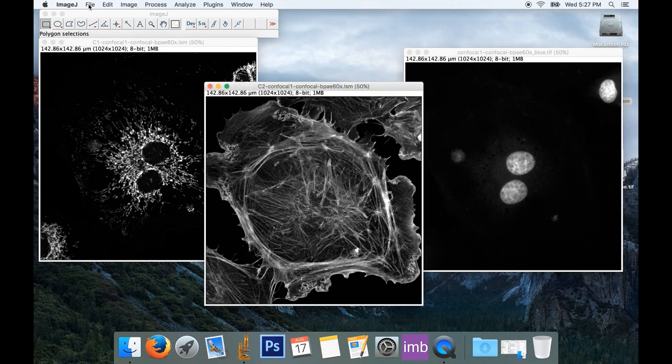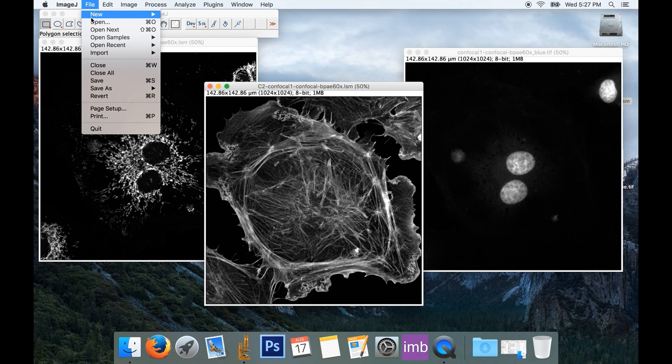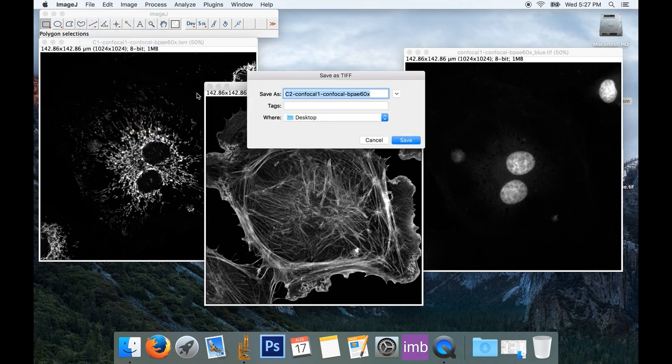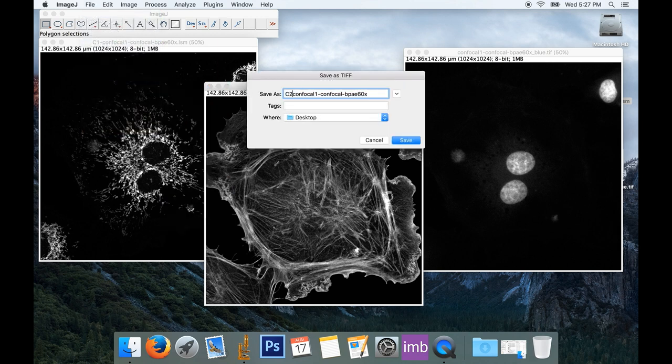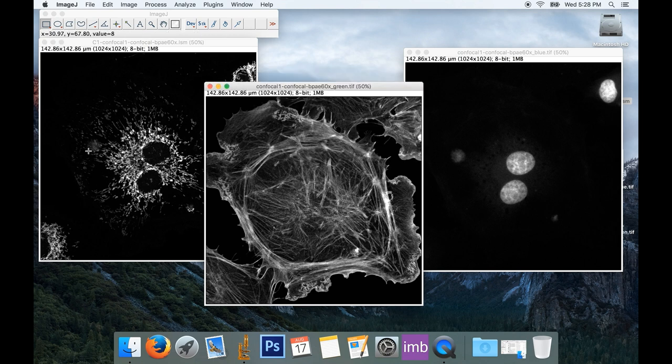I will do the same thing with the green. File, Save. And I don't like the naming convention. This one's not green, it's green. We'll save that to the desktop.